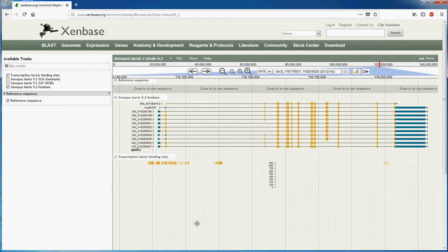So if you find yourself in a scenario where you see a gene of interest, like this one, PAX8, and you want to extract the different sub-features of the sequence, like the exons, the introns, the coding sequences, the untranslated regions, maybe the UTRs, the 3' and 5' UTRs, or even if you want the sequence upstream or downstream of the gene, perhaps, and you want to collect that.